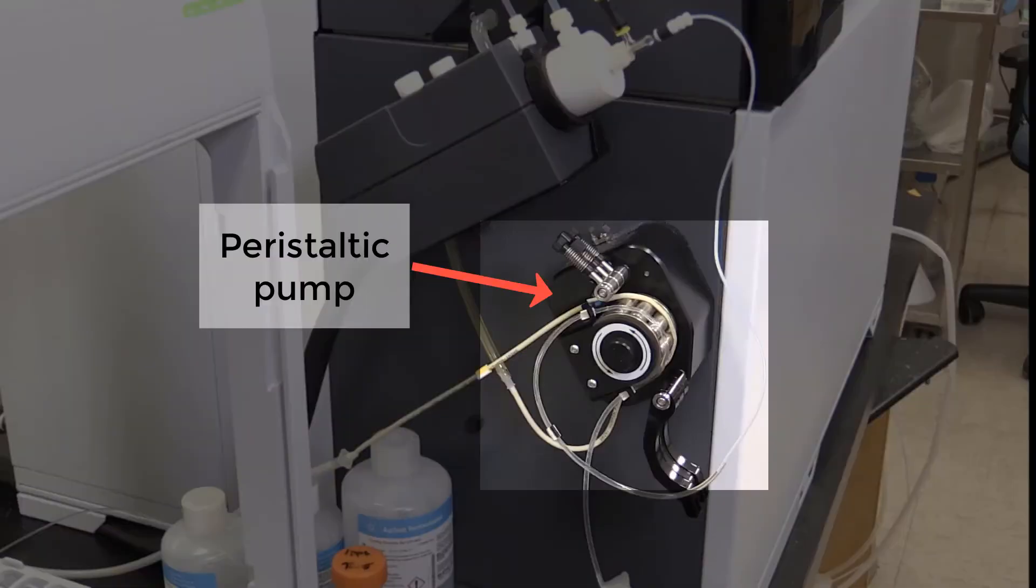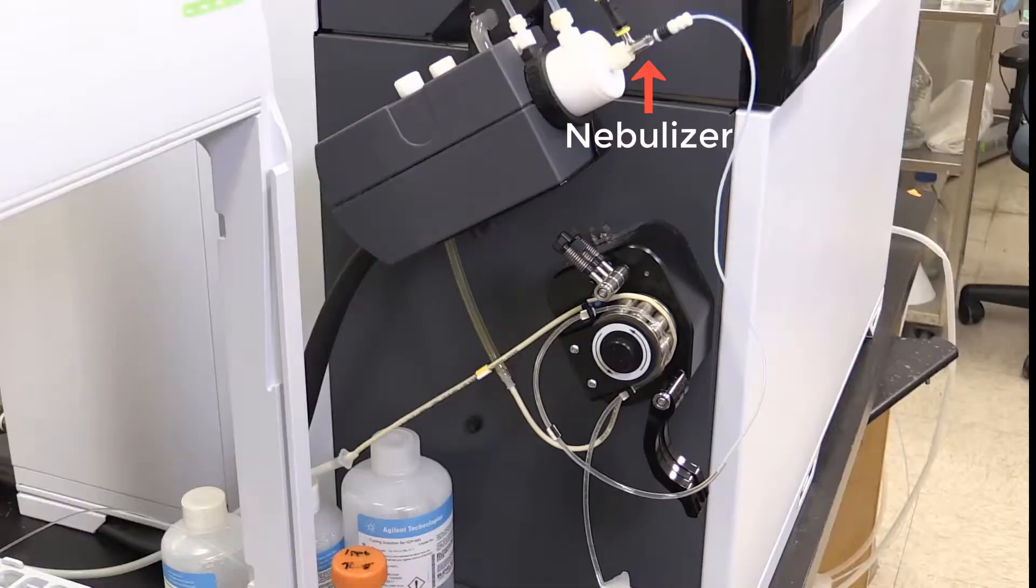Sample introduction. This is a peristaltic pump. It introduces aqueous sample to the nebulizer and removes waste from the spray chamber.